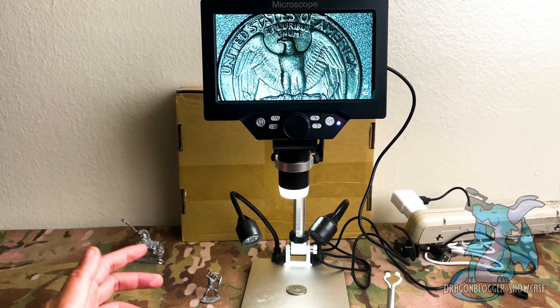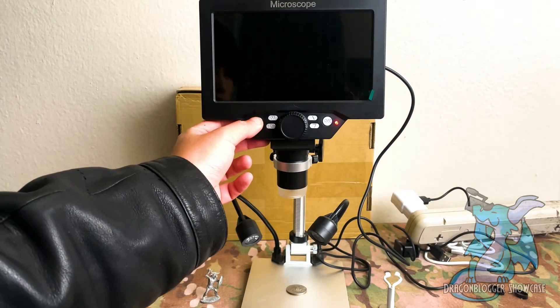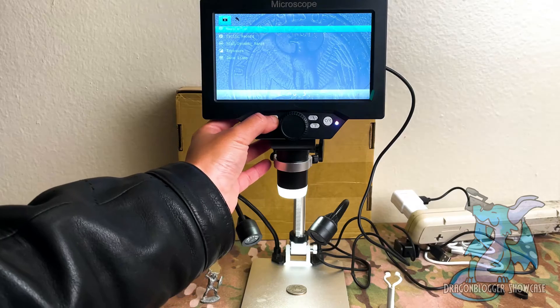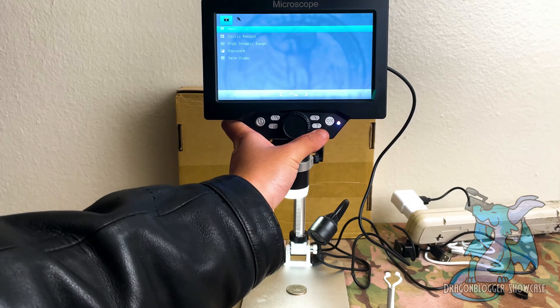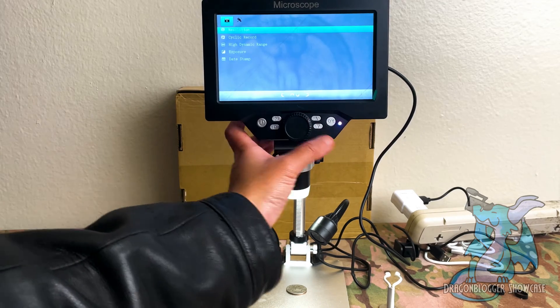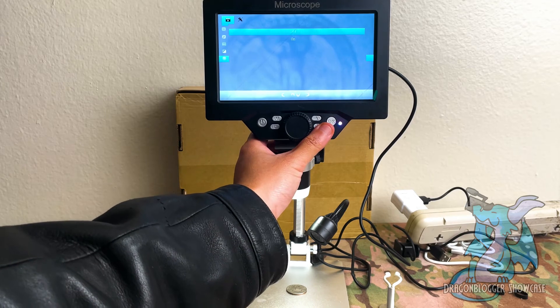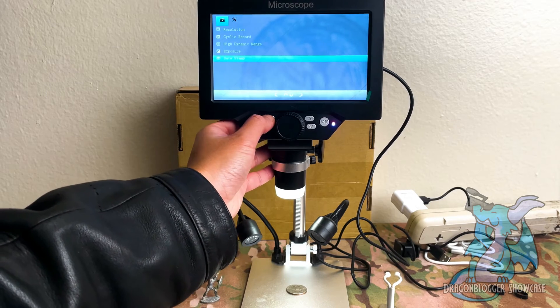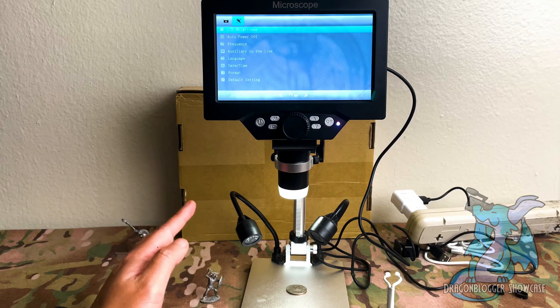Once you have everything assembled, it is very easy to use. You have a power button to turn it on and off. You have the ability to go into various settings and change things like the exposure, resolution, and different options you can take advantage of. It even gives you the option to show a date timestamp, which would apply if you're looking to save and output any images or videos — and this does allow you to do that.